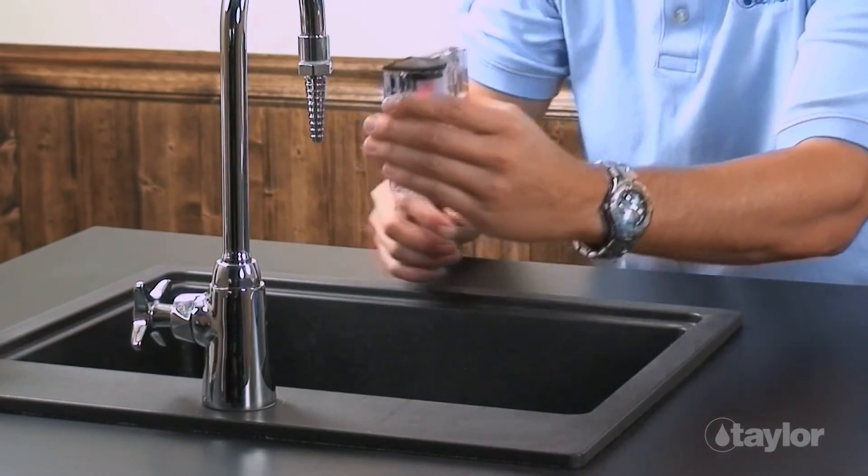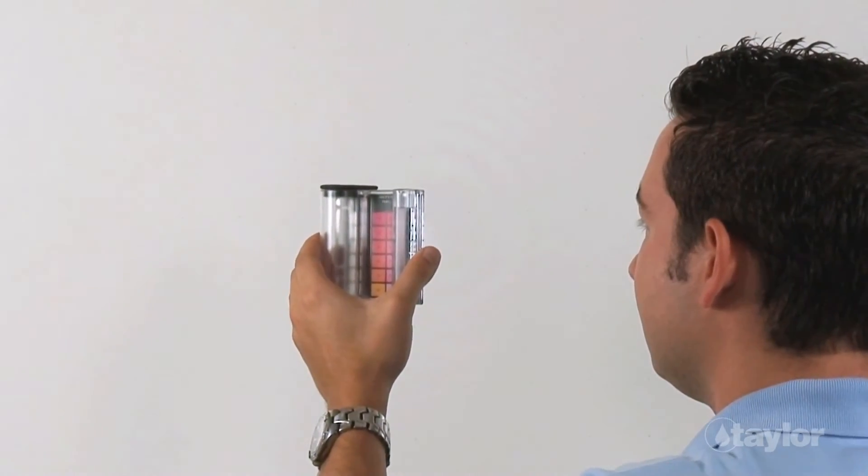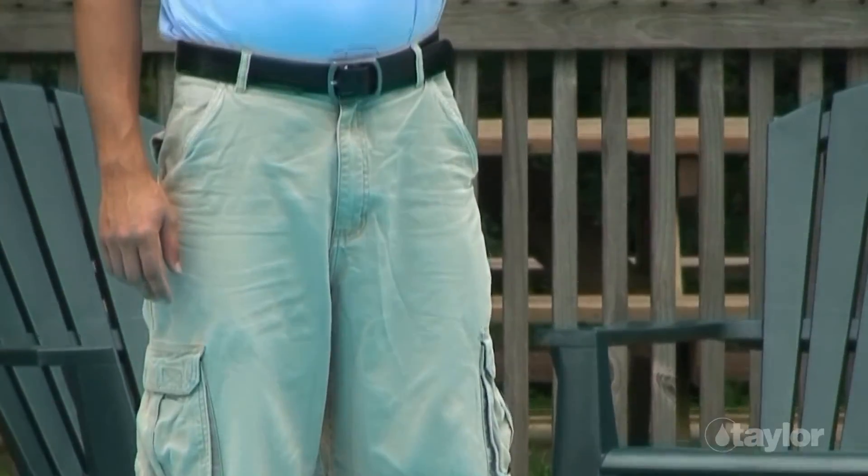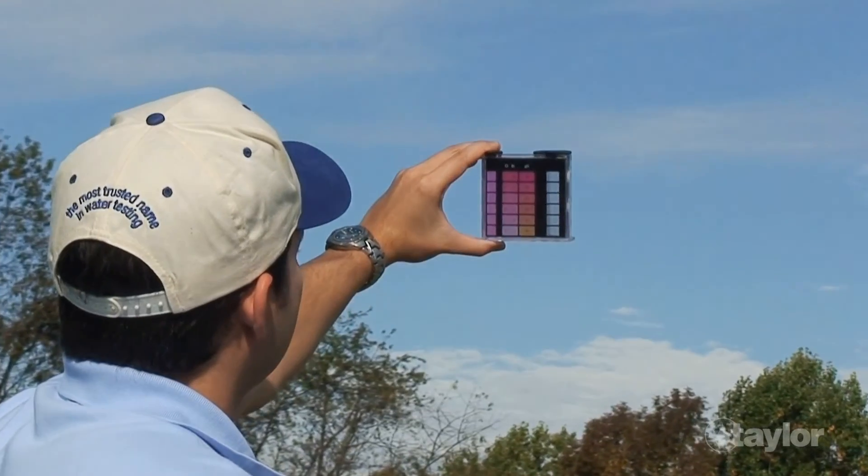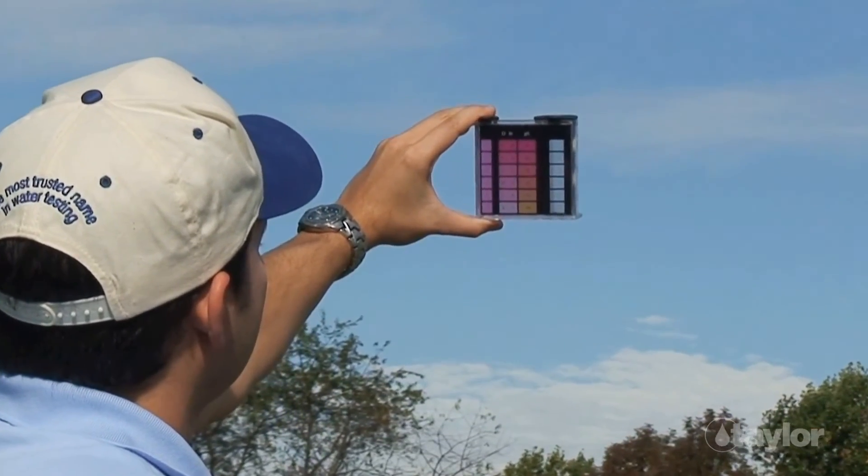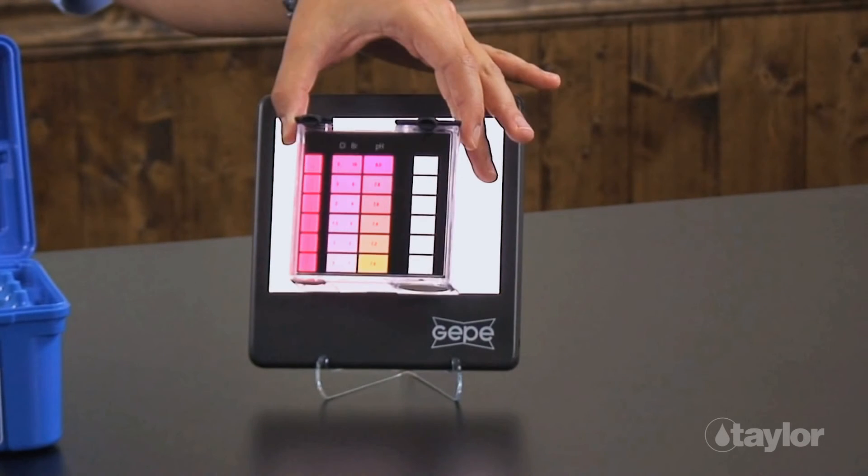Remember, color matching for the sanitizer and pH test should be conducted outdoors in natural northern light. When testing indoors, do these color matching tests with the aid of a daylight simulator.